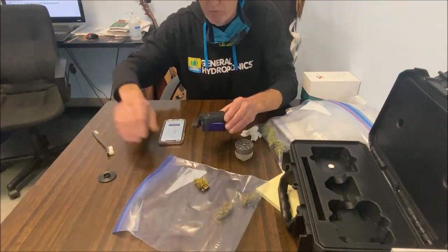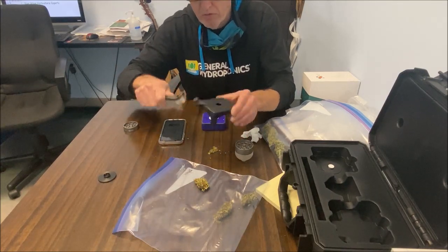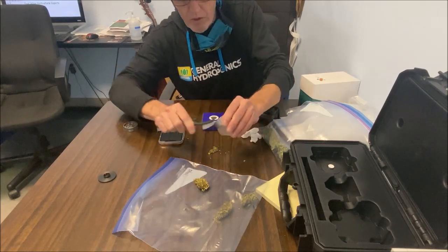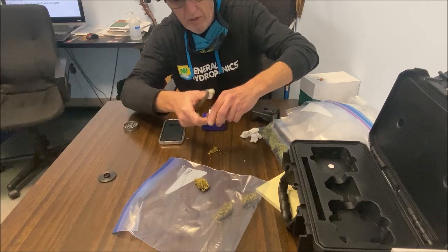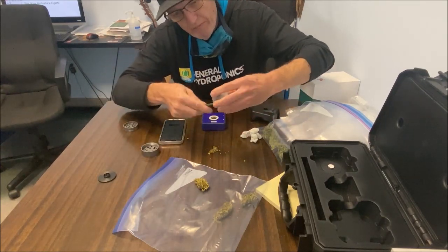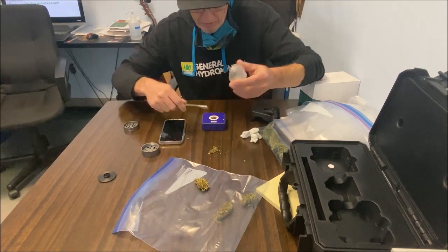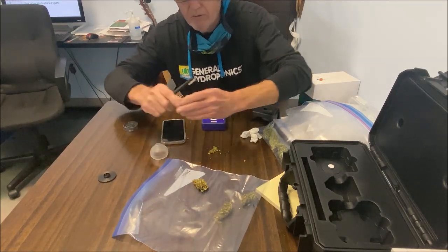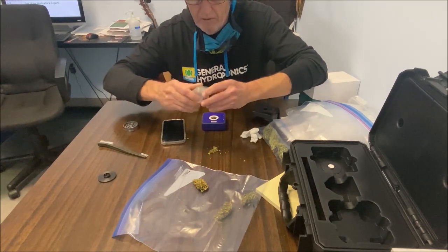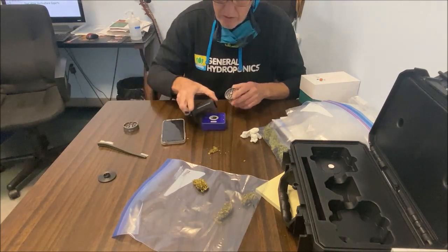So the first thing we do is we clean this up. They give you the brush. You make sure you get any residues off, everything swept off, nice and clean. We're going to clean the grinder. We're going to get in there, make sure that there's no residuals from the previous sample in there. And of course the little brush fits into all the little holes and everything just nice. Okay, so we're all good there. We got the residuals all off of there. And we're ready to test the next sample.